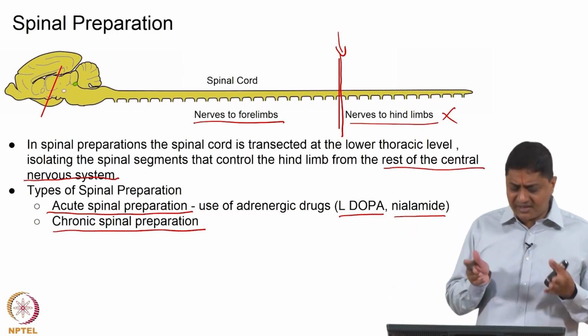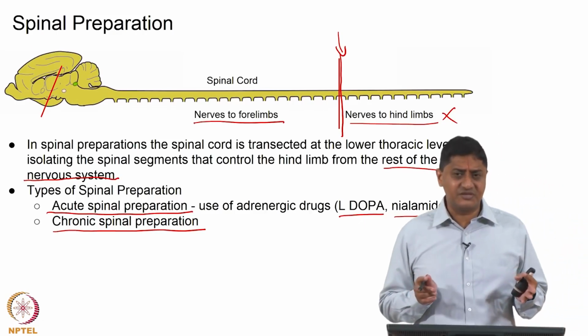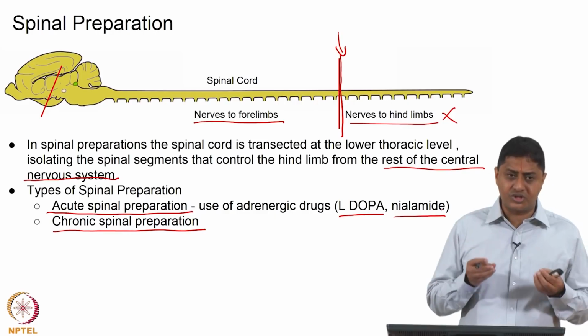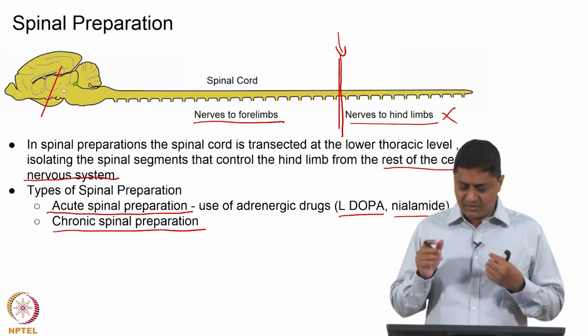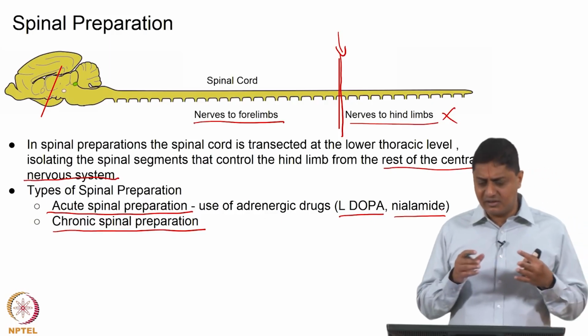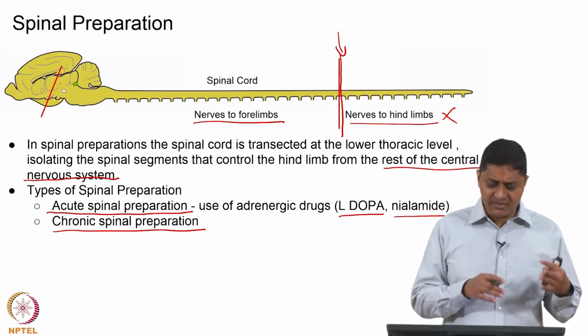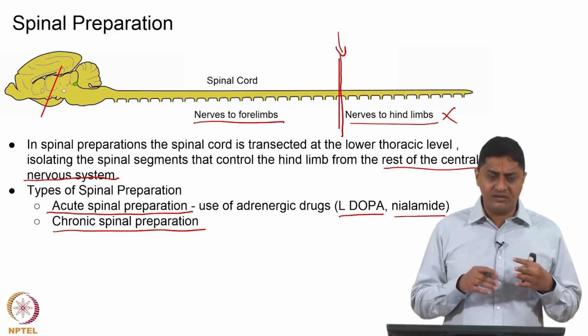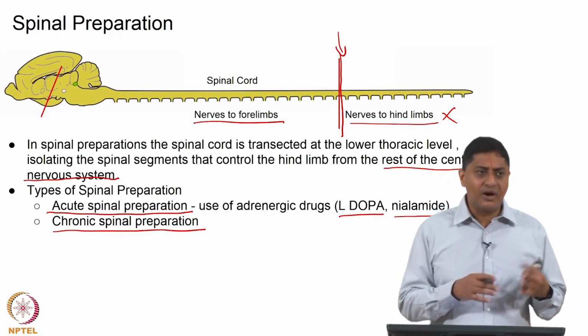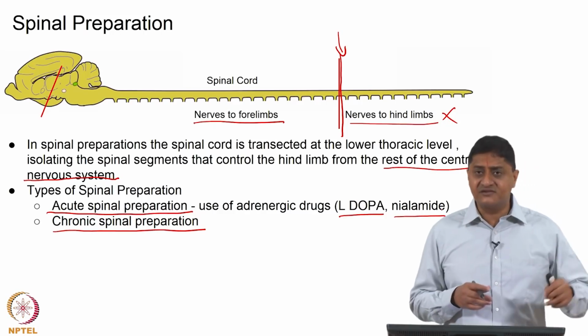So, mostly what are the animals that are used in these experiments? Most of these, in which we are interested in studying locomotion, involve the use of cats, and depending on the specific experiment it can be others like rats and mice in rare cases. To study locomotion we do not use monkeys so much, but there are other cases in which monkeys are used.